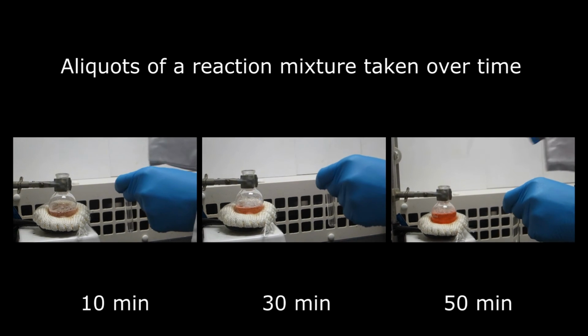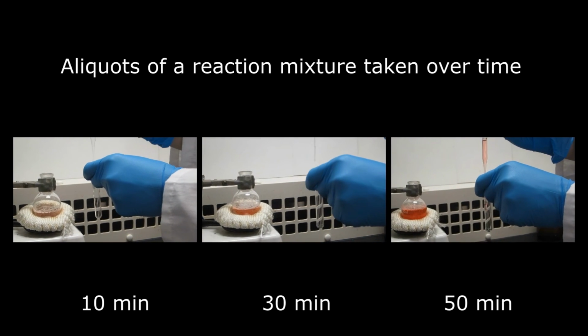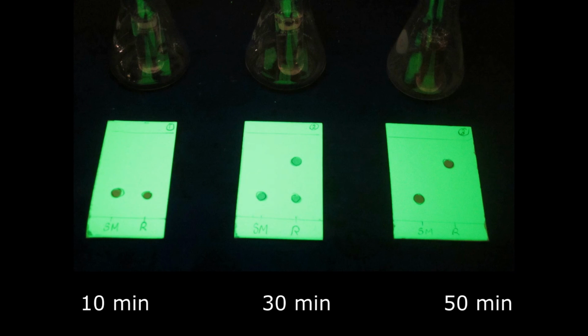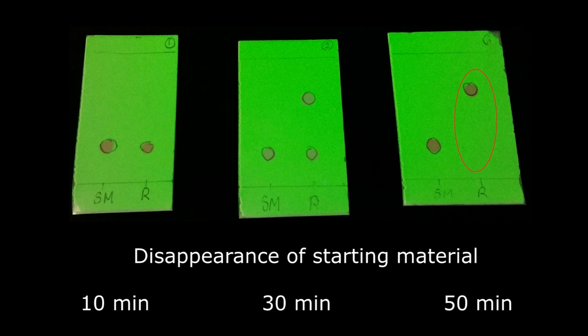To monitor the progress of a reaction, aliquots of a reaction mixture are taken over time. These aliquots are typically run on a TLC plate along with the starting material. If the polarity of the predicted product is different than the starting material, one should observe the disappearance of starting material and the appearance of product along with possible byproducts as time progresses. The reaction is considered complete once the starting material is no longer observed.